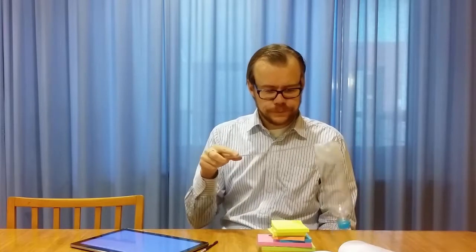And in dynamic mode there are several different approaches, but the main idea is to try to eliminate the problem of this dragging across the surface. And the first approach to that was to use tapping mode. And in tapping mode you do like this. So then you avoid when you scan the surface, you don't have this dragging friction on the surface. Instead you tap like this and measure the changes of that. So that is sort of a halfway progress to what's called the non-contact mode. This tapping mode is very easy, most machines can do that, and it improves the resolution very much. Of course there are perhaps some cases where you actually want to measure the friction on the surface.